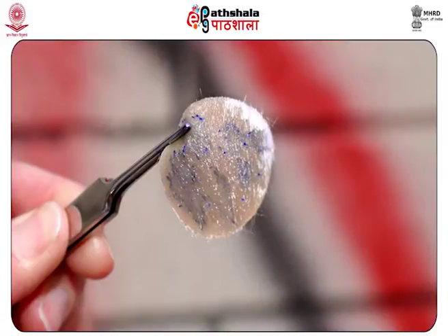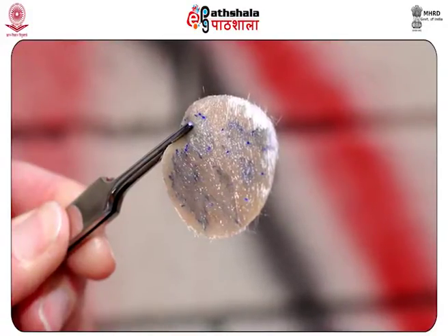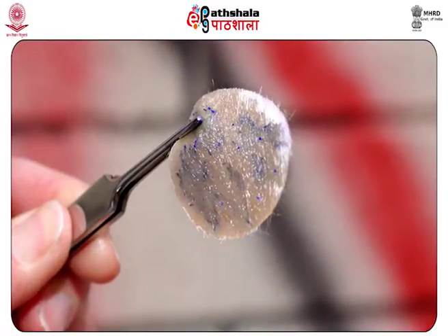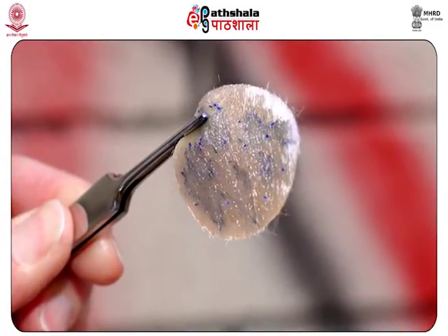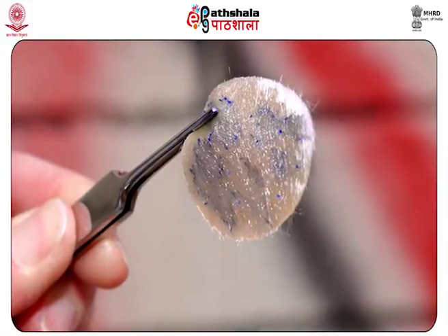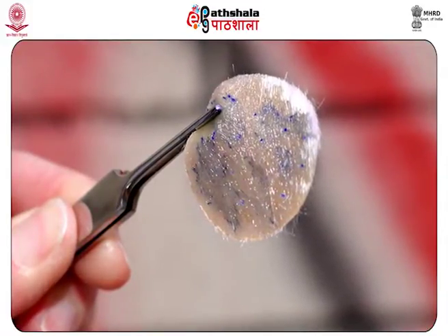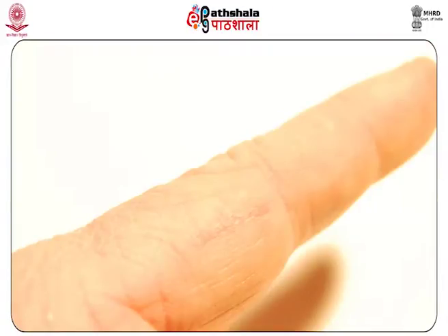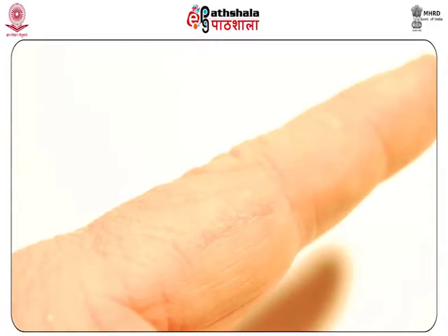Chemical particles, which are frequently referred to as firearm discharge residues, are also represented as gunshot residues. Gunshot residue is produced due to burning of powder, rubbing of bullet with barrel parts, and explosion of priming compounds. GSR particles may be found as inorganic elements, organic compounds, or gases.